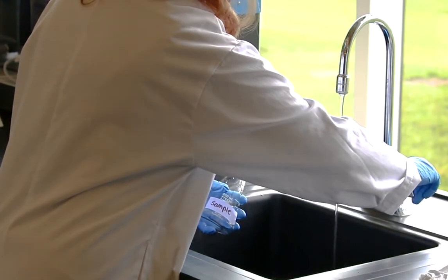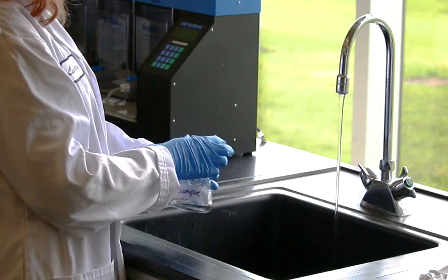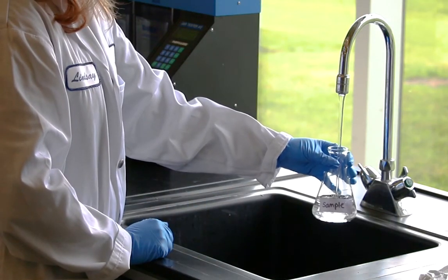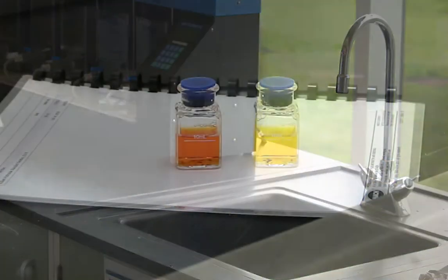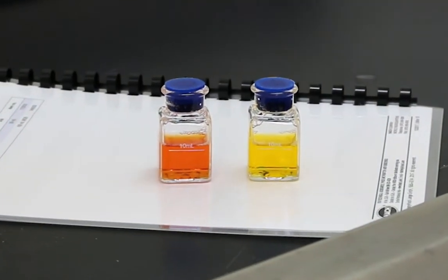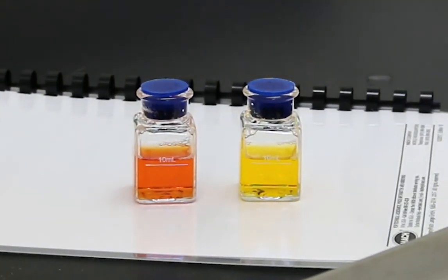In this test, the ascorbic acid reagent reduces all oxidized forms of manganese, and then the alkaline cyanide reagent masks potential interferences. The PAN indicator then forms an orange color complex with the manganese in the water.